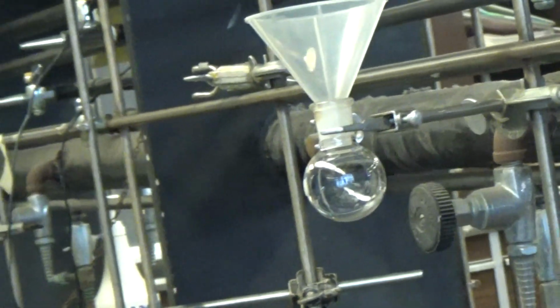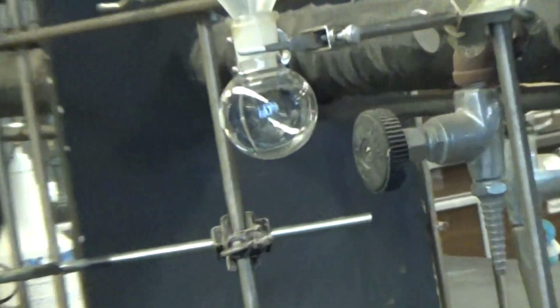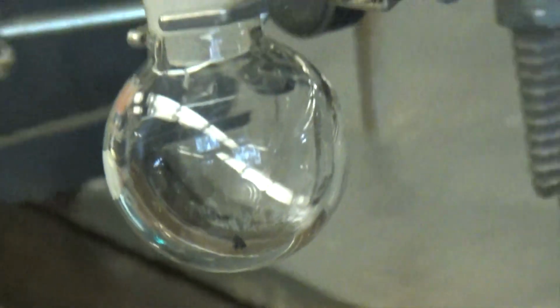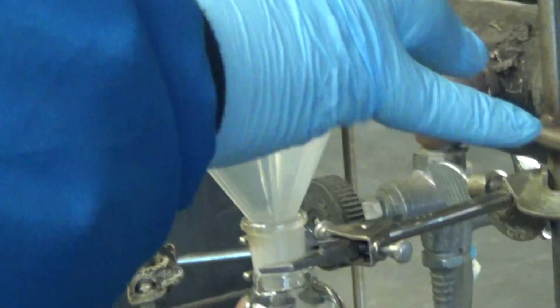We first add a boiling stone, which is basically the boiling chips. There's one here, and I can add a second one. It doesn't hurt. A couple of them, alright.